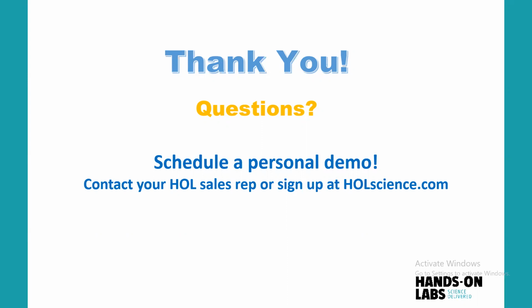Glassware has an inherent cost to it. So it really is determined, a ceiling, so to speak, on the cost of a kit by just how many lessons you incorporated into that kit, and certainly by the types of physical materials that are associated with those given lessons. But in general, just below $100 for standard kits, up to as much as $300, depending on the discipline and the types of materials.